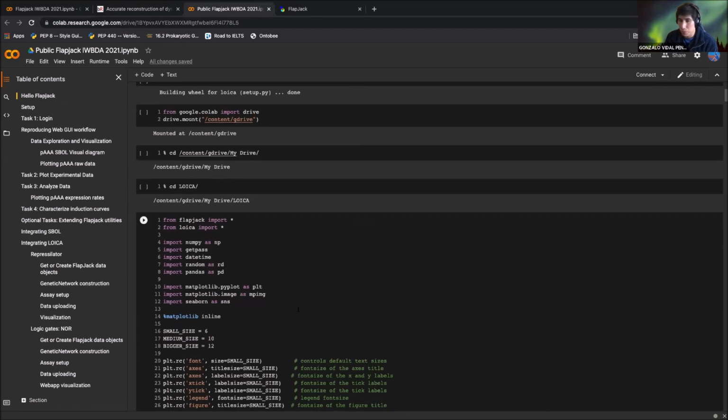Any questions, or if you want me to say anything again, or go through one feature once more, let me know. Otherwise, yeah. Could you show how to upload that data so that I can get through the thing? If no one else has questions, then yeah.